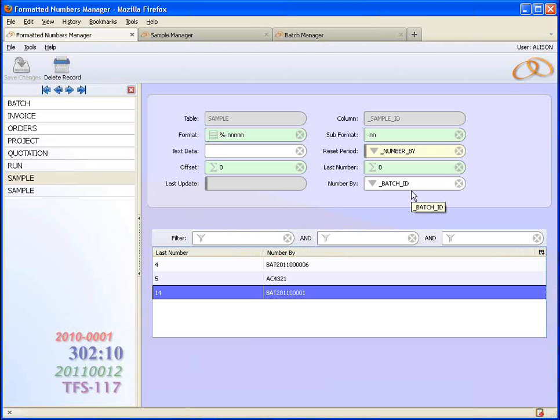I should say that you don't really want to come in here and fiddle with this on a day-to-day basis, because obviously the least serious thing that could happen was, say you had a report that's ordering things alphabetically by the batch ID, and your batch ID was NNNNN, and then someone says, oh, we're going to change this so it's Julian date. So then the beginning, you might be ordering it numerically, and then suddenly it starts off with Julian date and numbers on the end. So the least bad thing it could do is throw your reports out, so the ordering's not correct.